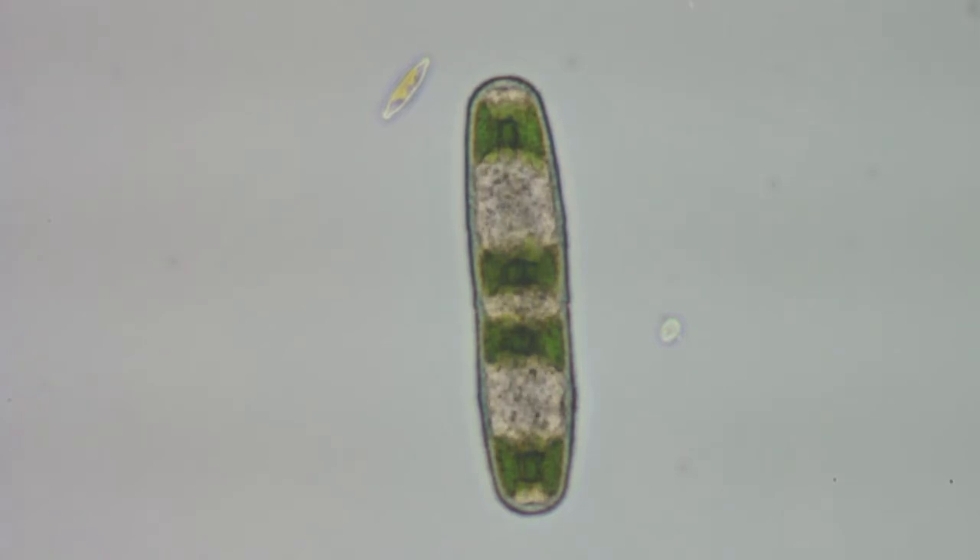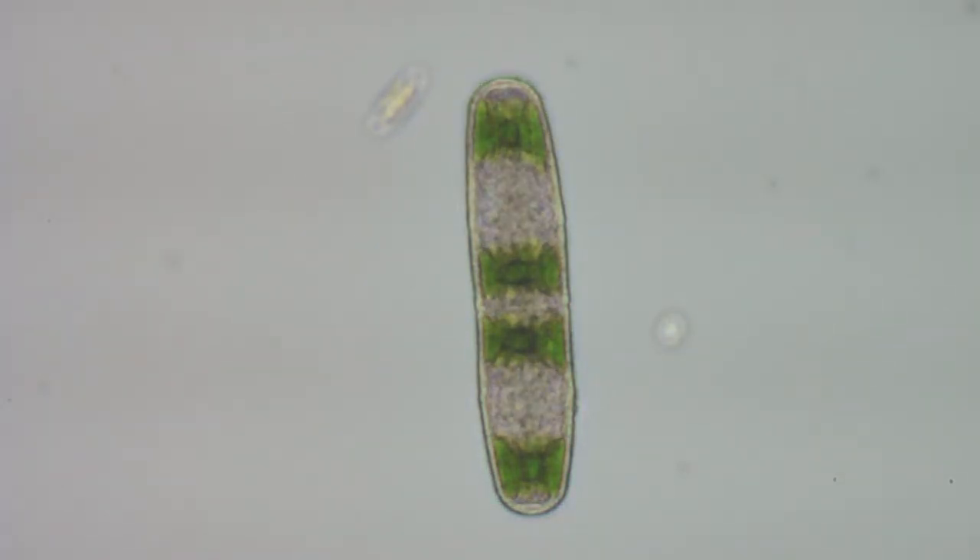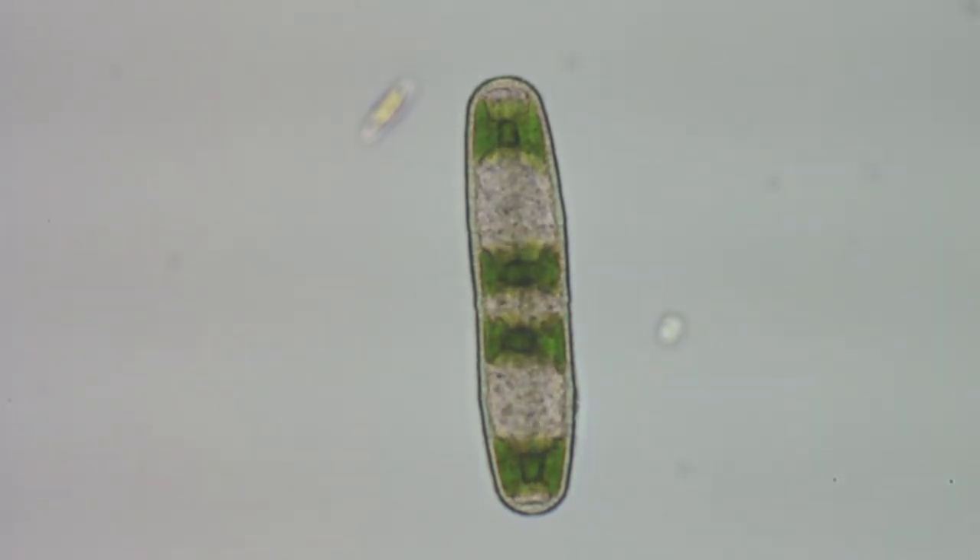I don't know what all that stuff inside is — it's moving around. The only time I've seen this before is when something was dead or close to being dead, bacteria or whatever was getting in there and eating it, or it was about to break down. But this one looks like it's alive because I saw it moving when I first found it on the slide.